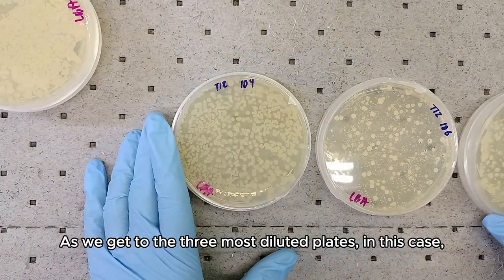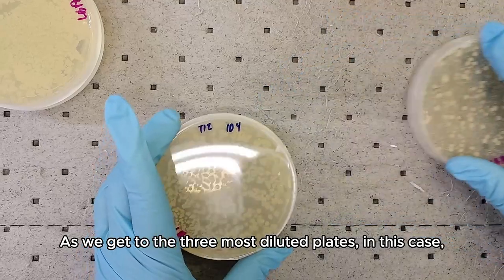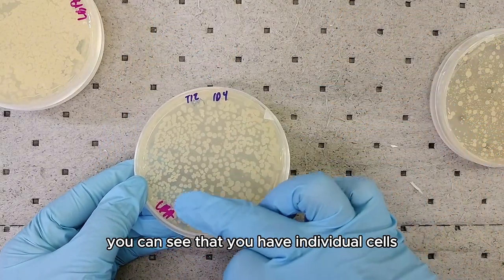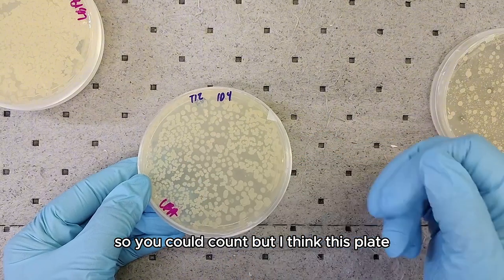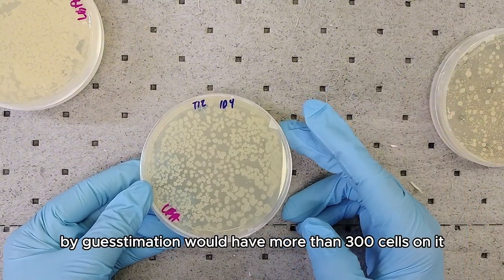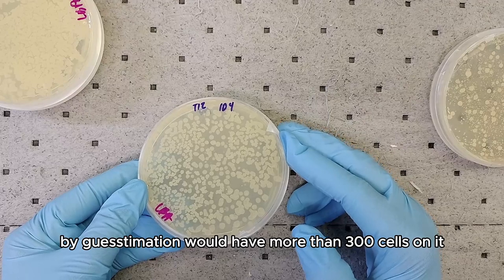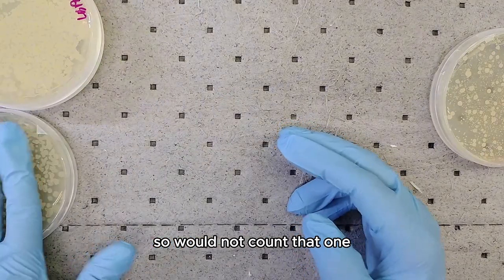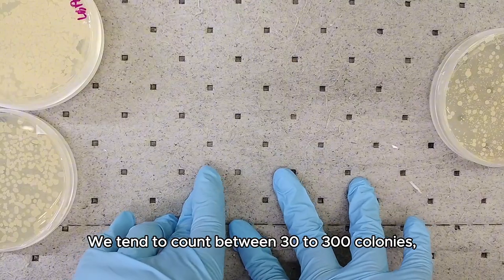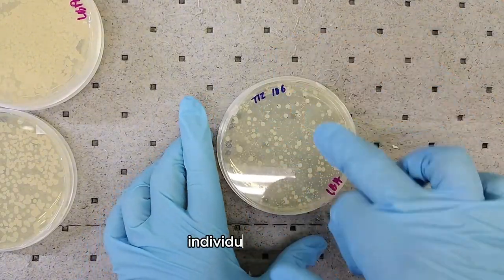As we get to the more diluted plates — in this case the 10 to the 4 — you can see individual cells, so you could count. But by estimation this plate would have more than 300 cells on it, so I would not count that one. We tend to count between 30 to 300 colonies — individual colonies. Some people might use 20 to 200.